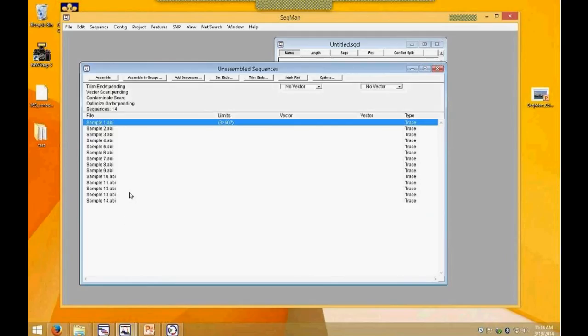And the reason that I'm looking at trimmers now is that if you have a project that's going to require editing, before you do any of the editing, you want to be very certain that you've done an assembly at the right stringency that limits the amount of manual editing that you might have to do. And so trimming and editing really go hand in hand. And so you want to be very familiar with the trimming tools that are available to you.